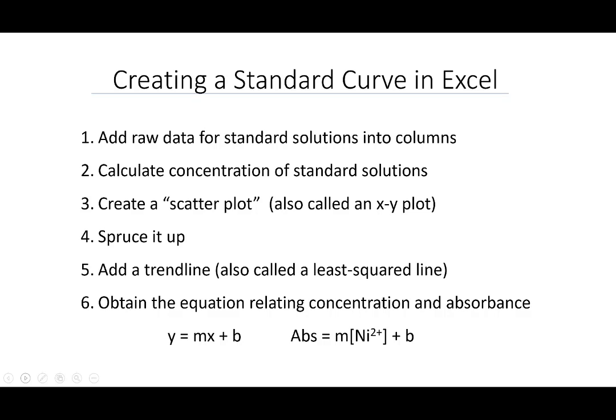Okay, so we're now going to create our standard curve and use Excel to do that. So what we're going to do, we're going to take the following steps.